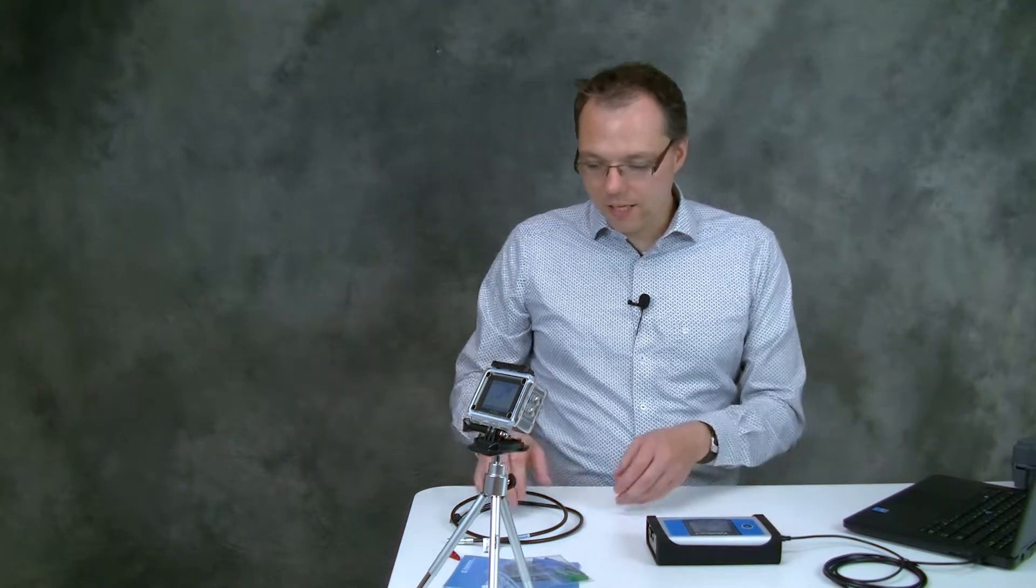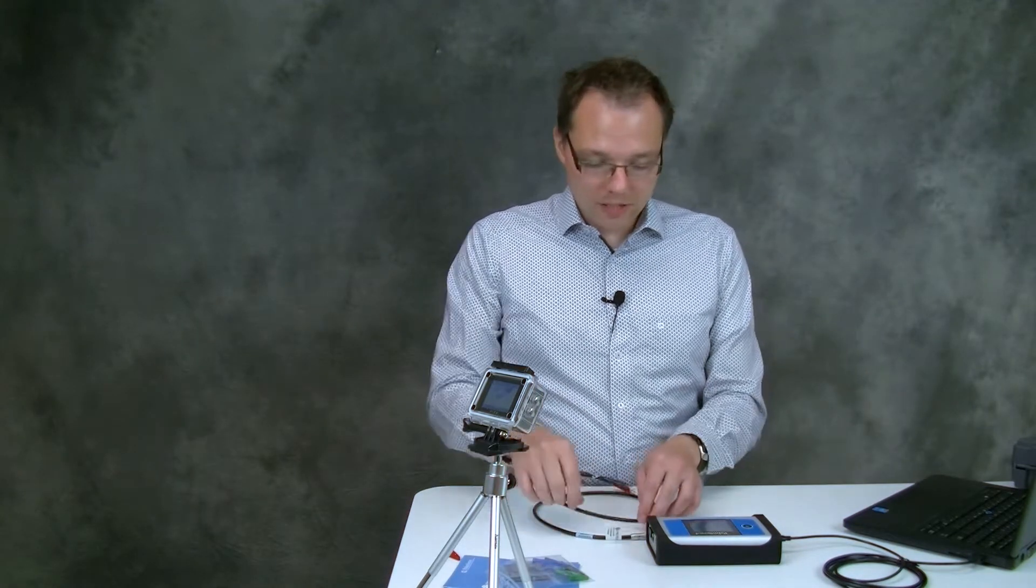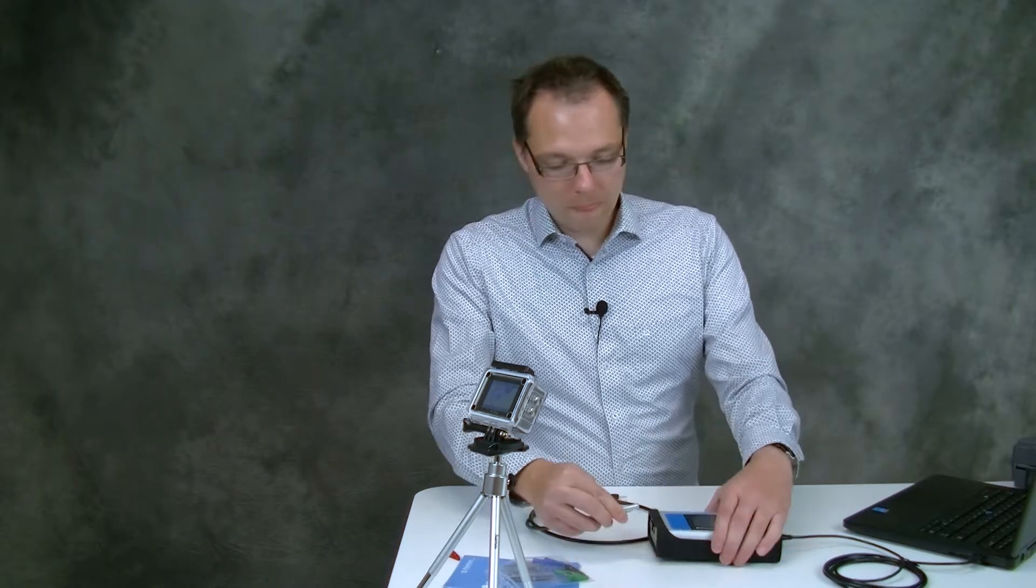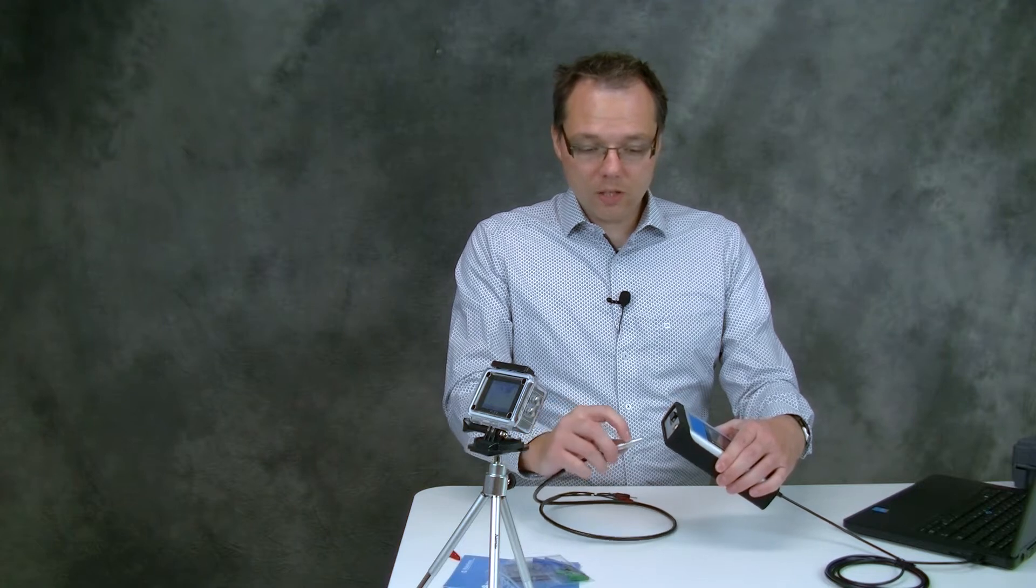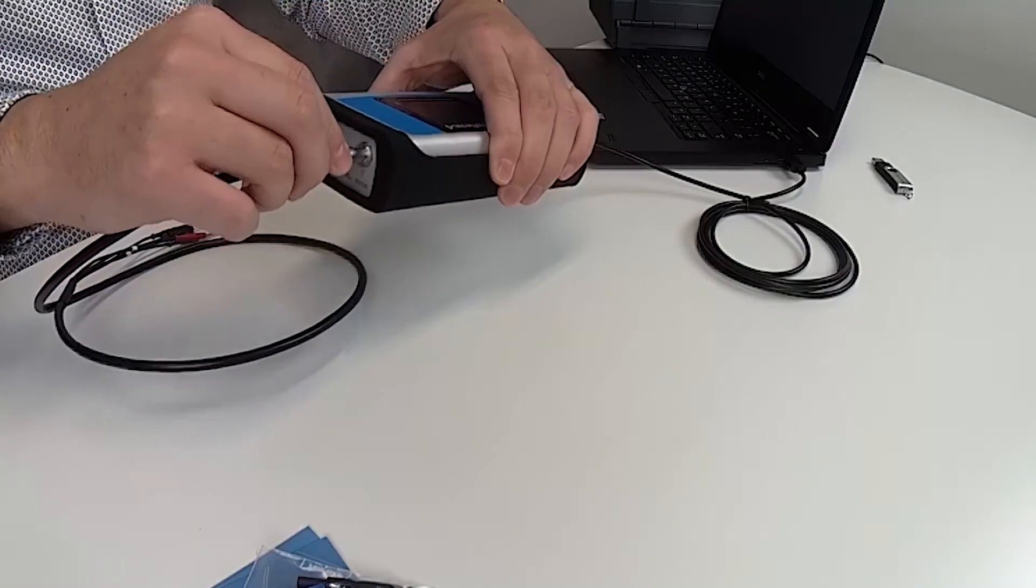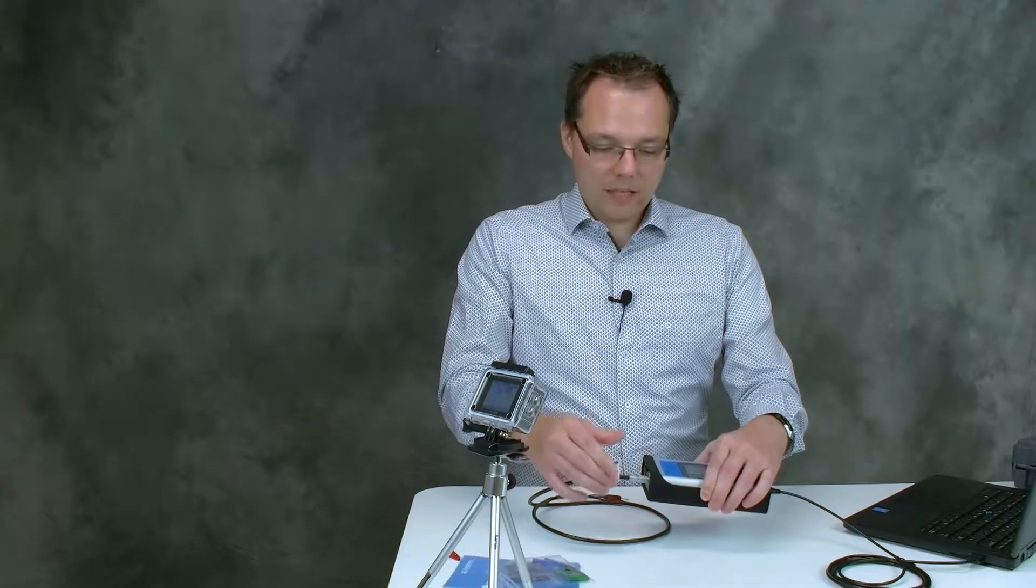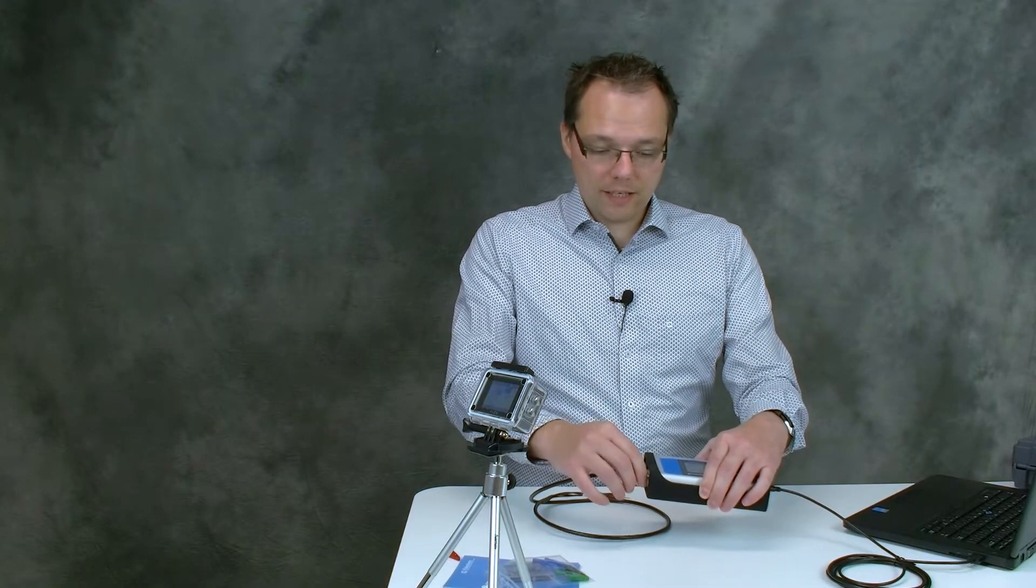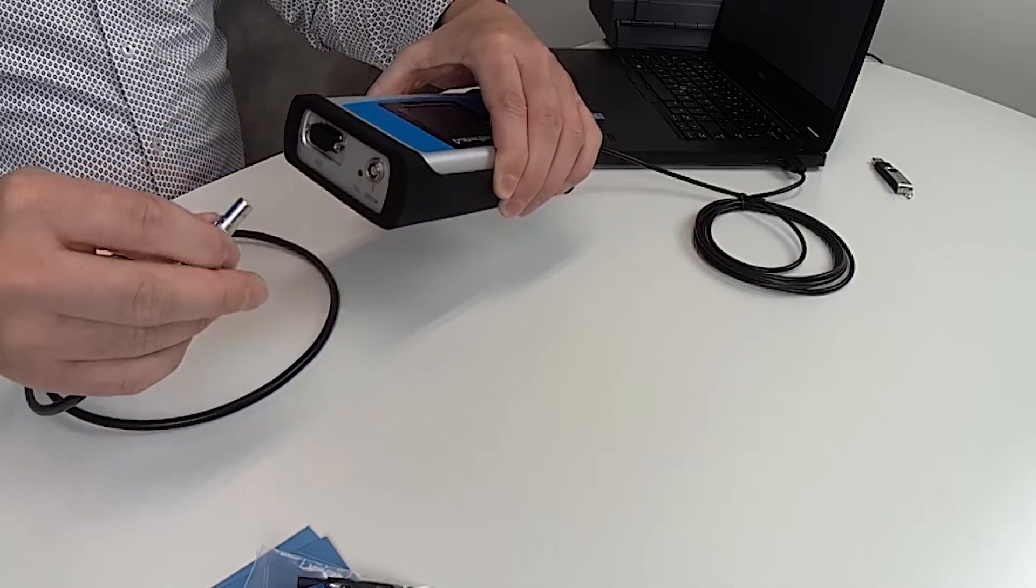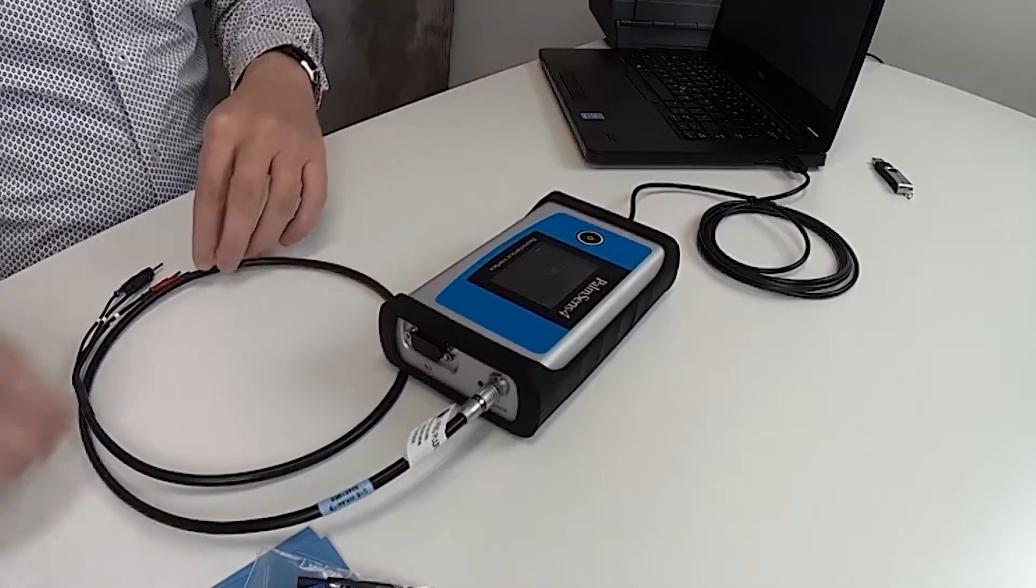OK so before we connect to the software we will set up our measurement so we can focus on working with the software. To insert the sensor cable you should look for this red dot here and make sure that it shows up. Then you just push it in and now it's tight. If you want to release it again just pull on this ring and it comes out again. So now we have plugged it in.